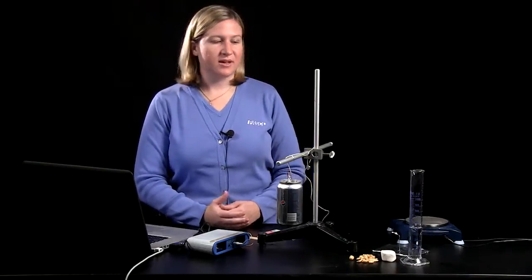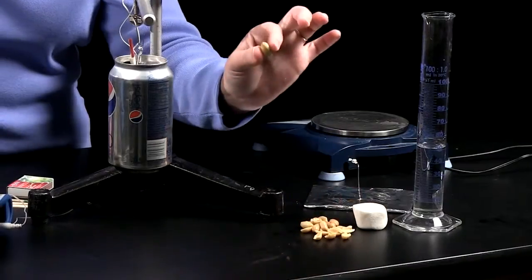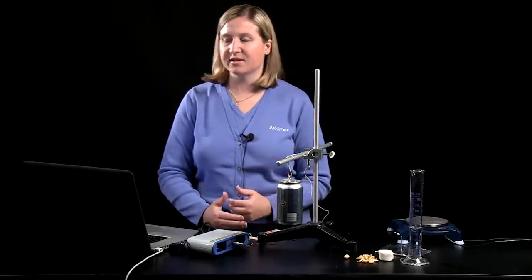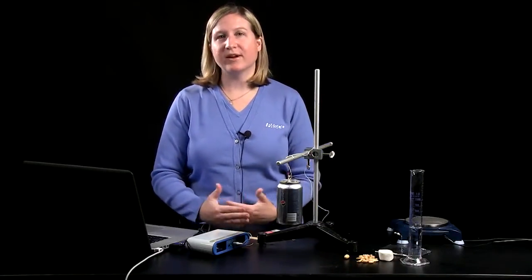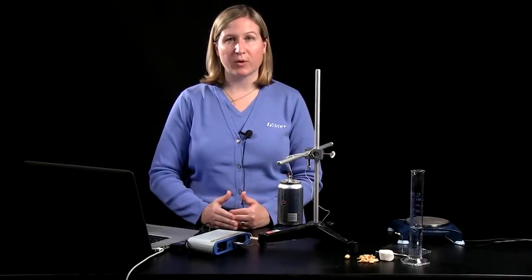In their discussions of their predictions, students might bring up the idea about the size of the peanut compared to the size of the marshmallow and whether or not that makes a difference. So that can lead into a discussion with students that really a fair comparison for foods is if we gather data on calories per gram.